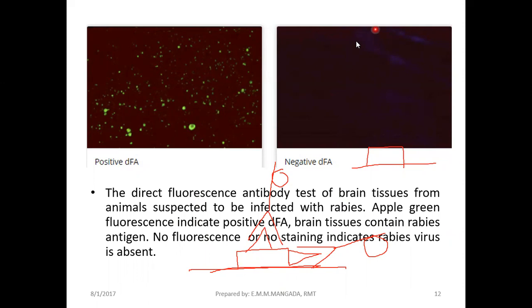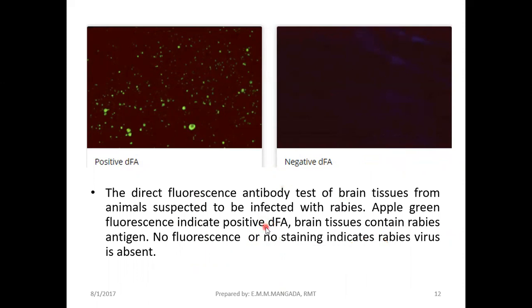So, that's the use or application of our fluorescence microscope. Pag-aaralan nyo to lalo guys pagdating nyo sa histopathology or histopathologic techniques and cytology, as well as in your serology.